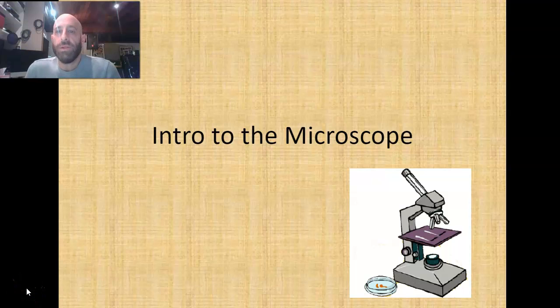We're going to do a quick little lecture on the microscope because the world of biology is microscopic. We're studying life here, right? And as we just learned, life is cellular. So when you think of a living organism, you should think of a cell. Some organisms are made of many cells, like us, we're made of trillions of cells, and some organisms are only made of one cell. But when it comes down to it, everything alive is made of cells.